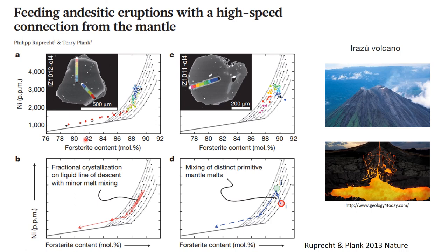Actually the magnesium content. The iron to magnesium ratio, shall we say. And as you can see, the olivines are not chemically homogeneous, okay, so the center of the olivines have got a higher nickel content and a higher forsterite content than the outside. Okay, and this is quite useful because this tells us something about the magma composition as these crystals have been growing. Okay, which tells us something about what the conditions are like in the magma chamber underneath the volcano.